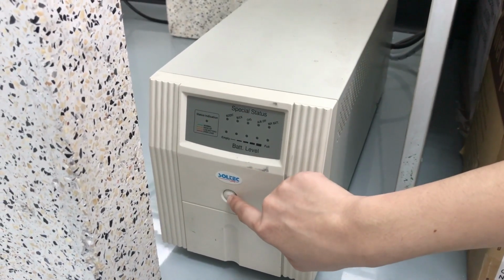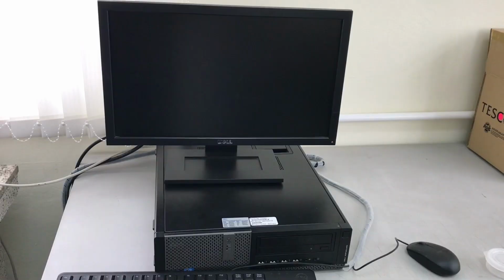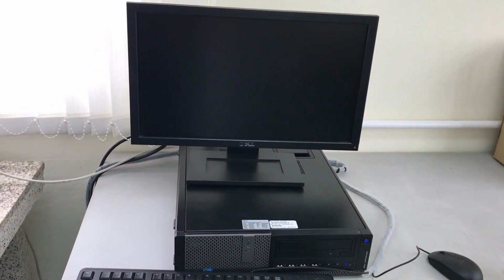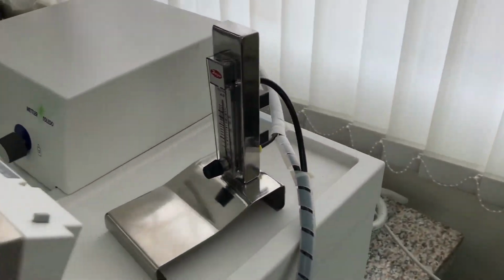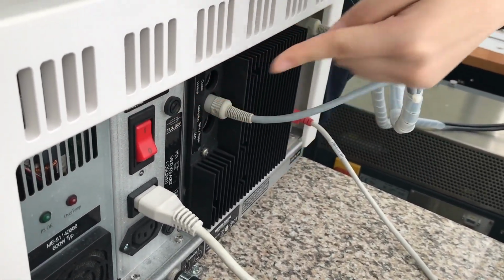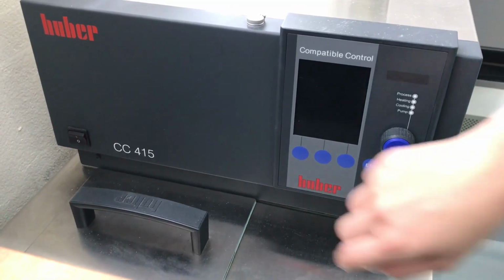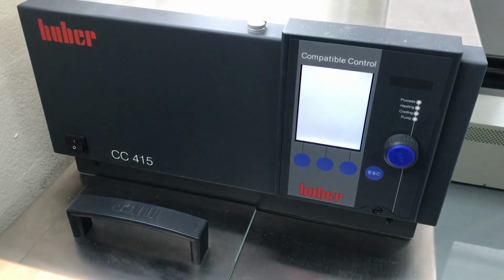Turn on the power supply by pressing the circle button. Then turn on the computer. After that, press the red switch behind TGA unit to turn it on. The cooler unit is opened by pressing back switch in front of the cooler.